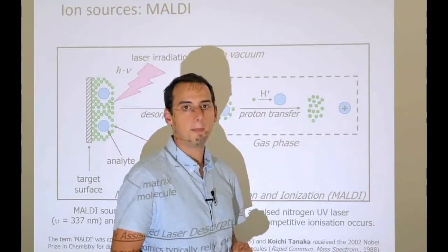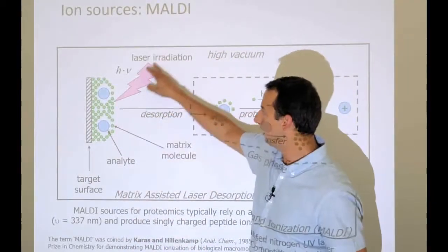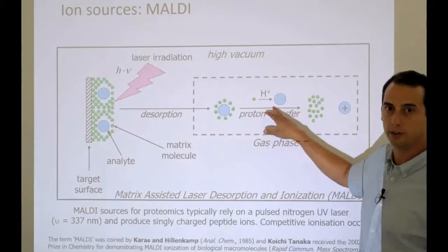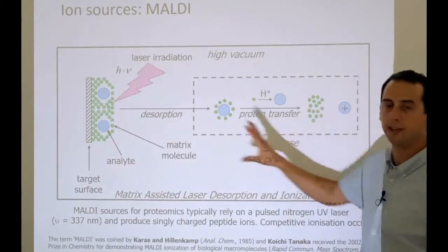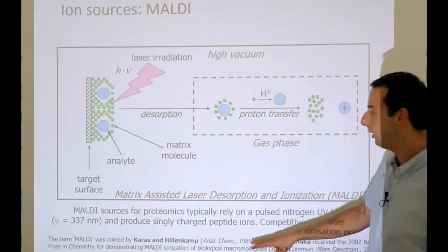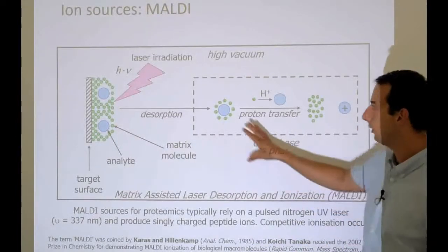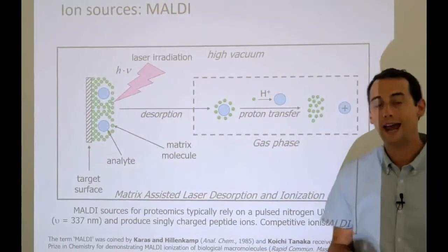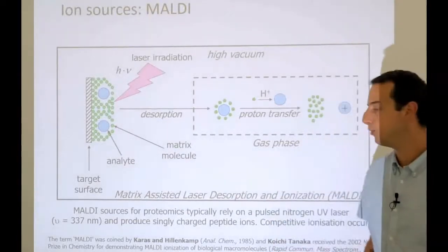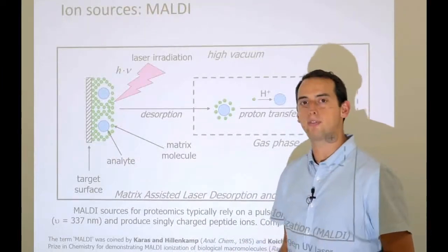So as you can see, MALDI is really true to its name. We use matrix together with the sample to assist us in laser-guided desorption and then ionization through the matrix. So it's a very good name for this entire process that is pretty violent, but is still known as a soft ionization method. Interestingly, Koichi Tanaka got the Nobel Prize back in 2002 for his discovery of MALDI as applied specifically to large macromolecules, in that case a protein. Two other names that you should associate with MALDI are Karas and Hillenkamp, who really pioneered the technology itself, but primarily for small molecules.